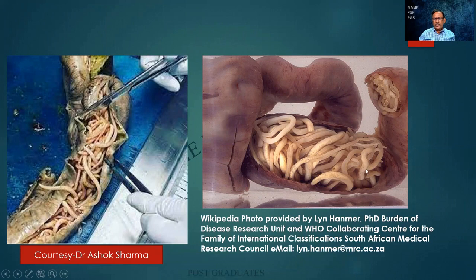So I find that it is a tangled bag of worms, or if you people cannot identify it, remember this. So it looks like noodles for you. You people can cook and eat it. Ascaris lumbricoides. So you find that it proliferates, it multiplies, it obstructs, and there is also a twisting leading to a volvulus. Obstruction alone is not the thing, but the ultimate culprit, catastrophe, can be because of the volvulus that it can cause.